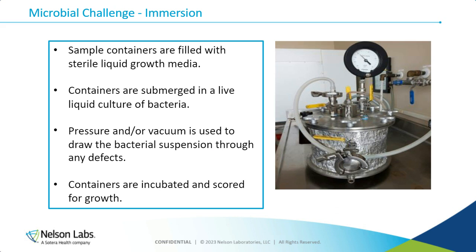In the microbial challenge, which is an immersion test, I am taking my sample containers and I'm going to fill them with growth media because I'm using microbes and I need some kind of culture media that's going to turn turbid as an evidence of growth, so that I can look at that visually and see that my indicator, which in this case is a bacteria, has moved across the barrier.